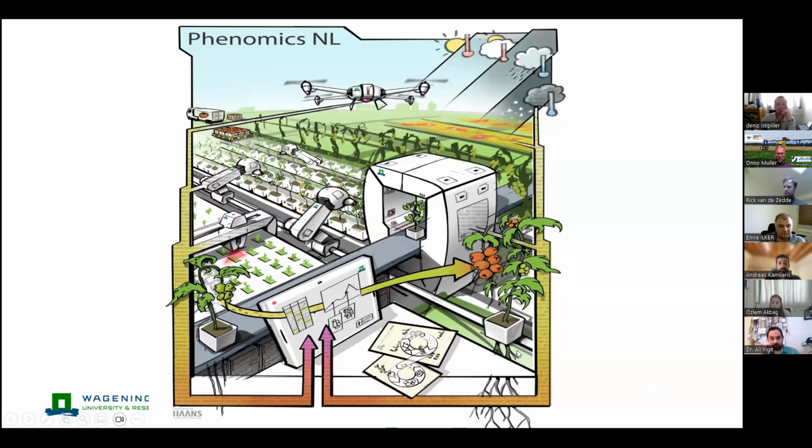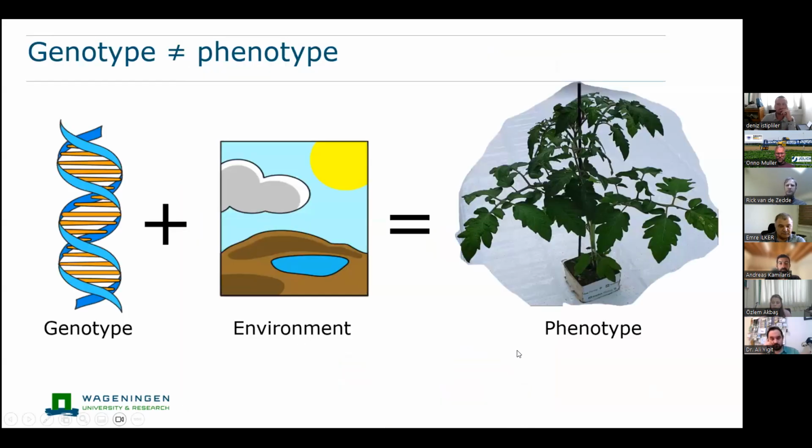And the roots are complicated. And it all matters. So everything matters. So you're measuring a certain phenotype. So a number of leaves, the greenness, ground coverage. So those are phenotypic traits. But then you need to be aware that you also have differences in your phenotype caused by, on the one hand, the variety, the genotype that you have selected in your trial, but definitely also your environment.